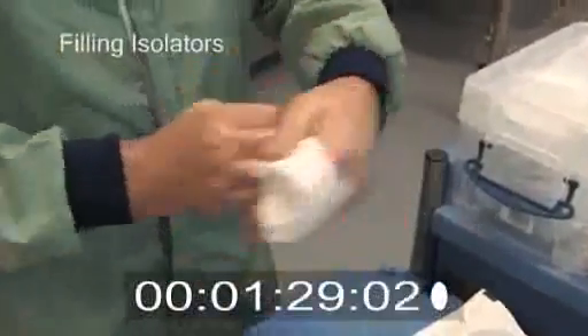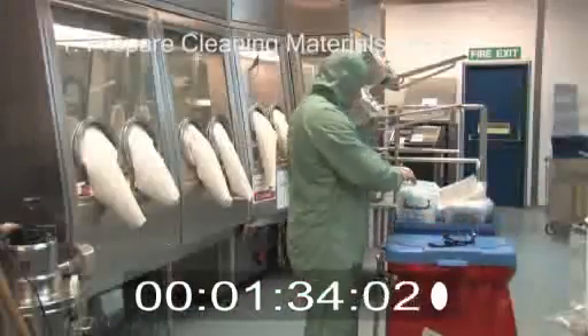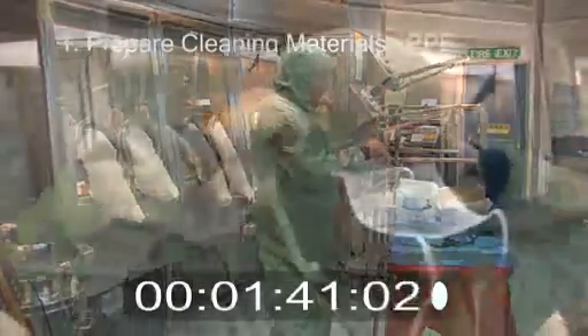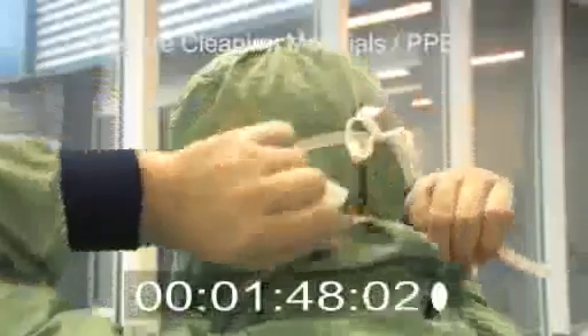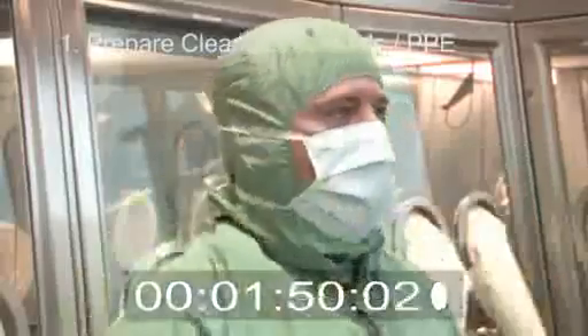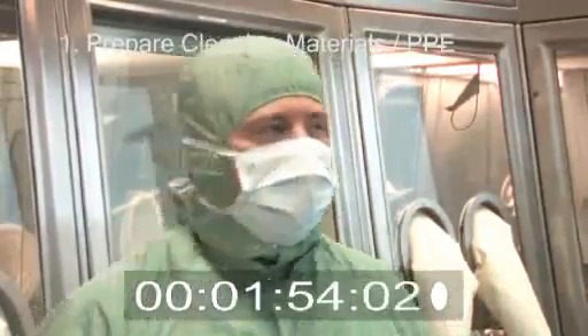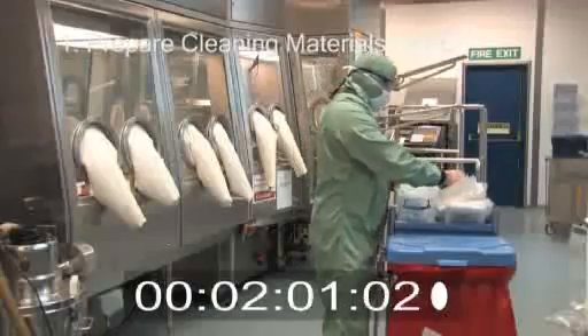Before cleaning begins, the operators must ensure that they have all the material they require for the cleaning, that any cleaning solutions required are correctly prepared, and that any tools required are available. Details of cleaning solutions and wipes will be covered within the SOP for the line. Gloves and a mask must be worn at all times during the cleaning process. Wearing this PPE both protects the operator and prevents the operator from re-contaminating the areas they are cleaning.